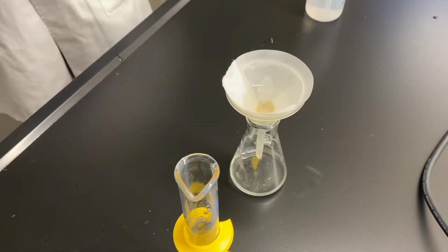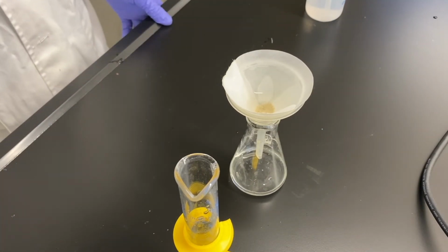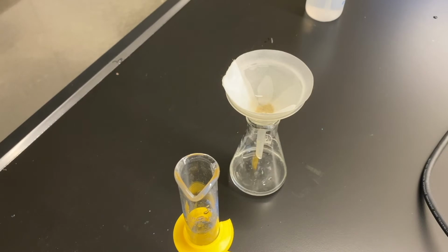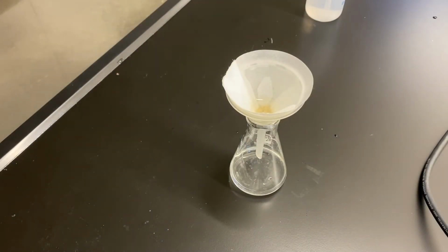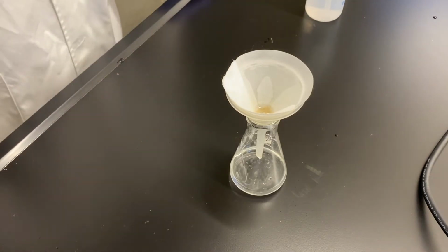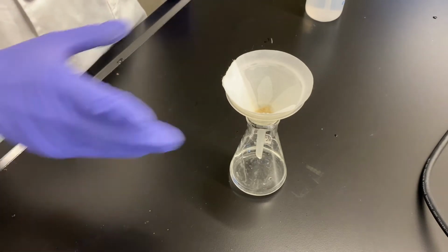And we wash it with just a little bit of water to make sure, again, we get all that calcium ion into the actual water. And later we're going to precipitate it with some carbonate ion to make calcium carbonate again so we can get the mass of the calcium carbonate. It's nice this time I didn't have to hold it. Getting smarter.